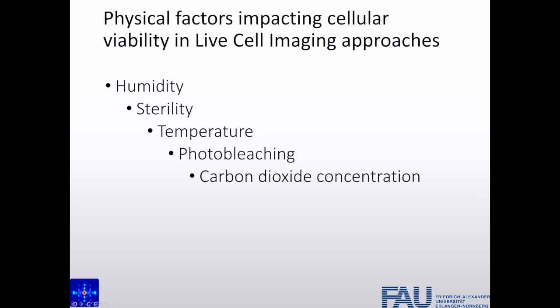The carbon dioxide concentration in the sample, of course, this is a really important factor. You can omit this when you work in HEPES buffered systems, because the carbon dioxide changes the pH level in the medium. Everybody knows, we see that in buffered media when there's a shift in the phenol red color, then you can already see that there's something happening. I show you also some techniques how you can monitor and control this carbon dioxide concentration in your live imaging approach. And the most important thing, of course, is phototoxicity.